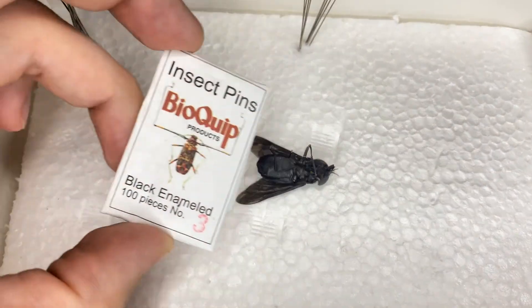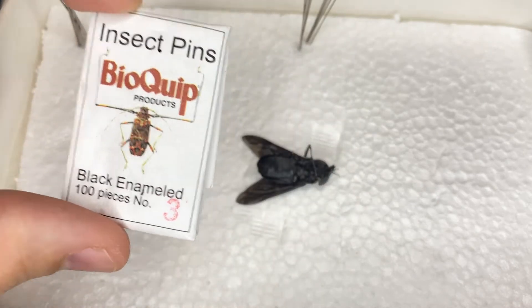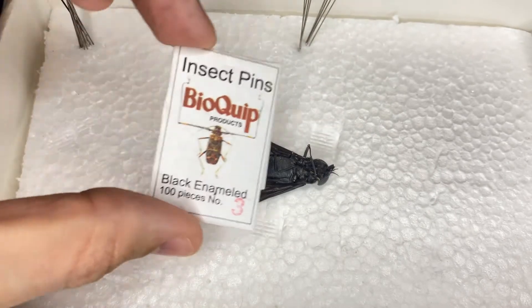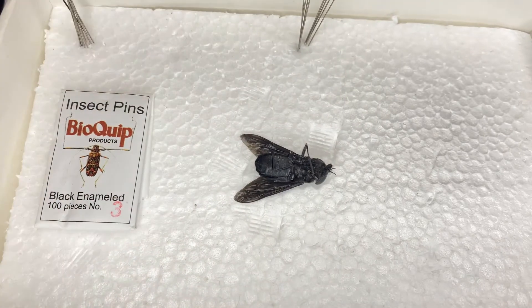Besides the bug, we also need our pins. I'm using size 3 insect pins. I can't use a regular pin that you buy at Walmart. You want an insect pin so it does not rust and kind of fall apart on your bug, because pinned insect specimens can last hundreds of years if they're properly cared for.